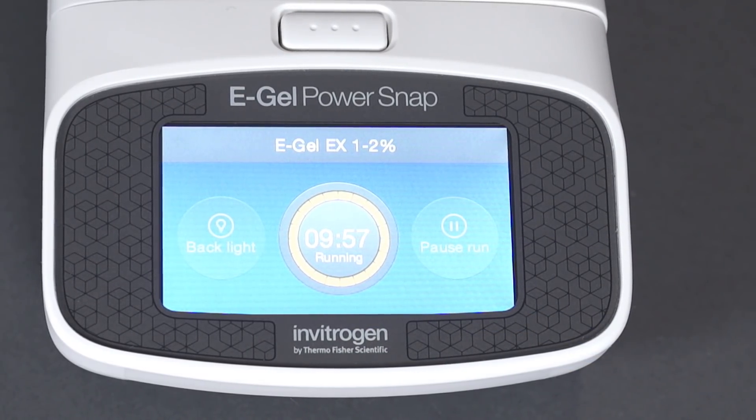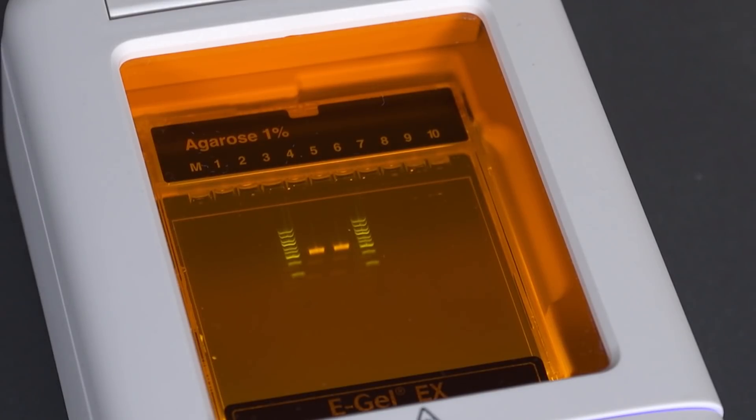Visualize samples in real time by selecting the backlight button. The integrated amber filter ensures safe sample viewing without the need to wear protective glasses.